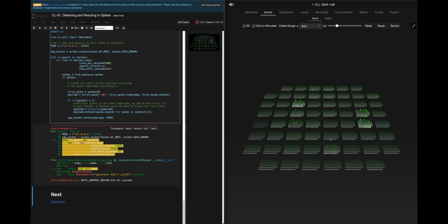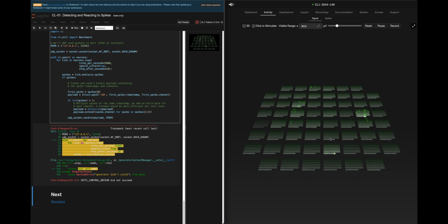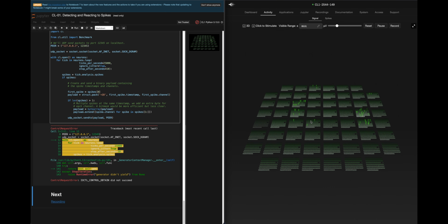We're focusing on Cortical Labs stuff, but one of the things I've found is I don't think it's a latency thing, but it is just a quirk of UDP, because you're saying that streaming the packets is more important than them arriving, and usually that's never a problem. But if you're relying on the data coming from this machine to make some sort of assumption about how you're going to continue to stimulate or whatever, you really want to be smart and thoughtful about that.